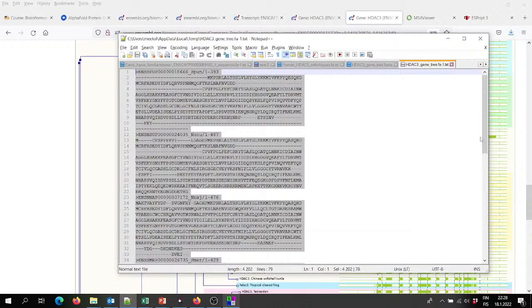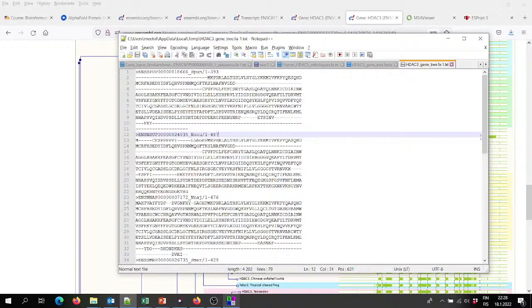This is all I want to show of gene trees. It's a lovely tool, a very complex one if you want to find out exactly how they are built, but even without the full understanding, you can make use of the nodes which work as links and use them for just studying the gene tree, seeing which sequences are complete or incomplete based on the green alignment symbols, and then retrieving alignments of just some subtree in your gene tree.